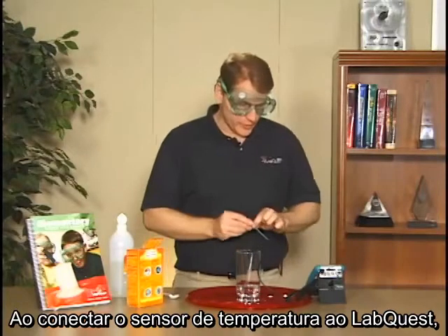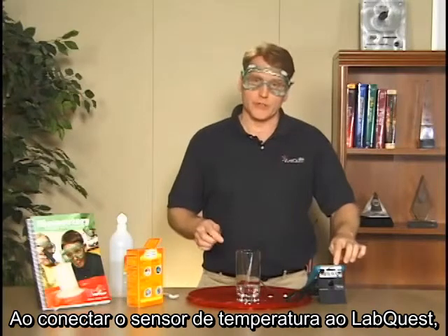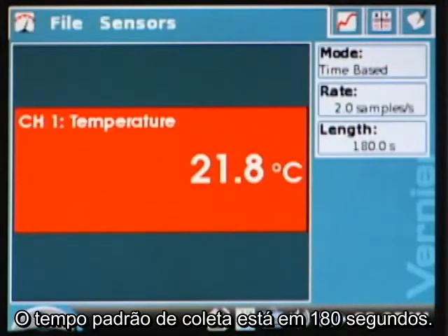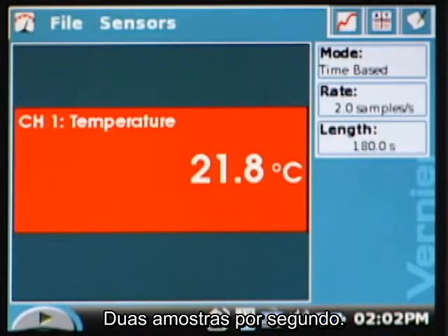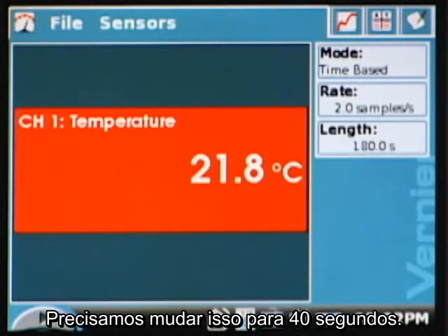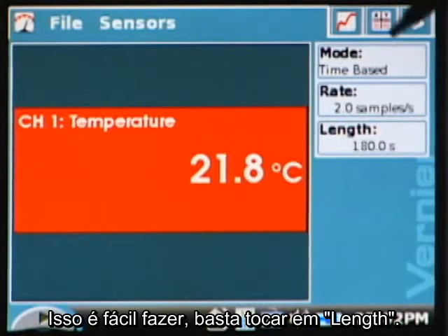When you plug in the temperature sensor to the Labquest, it auto-IDs the sensor. And right now it defaults to being 180 seconds for our time and 2 samples per second. But in the lab, it doesn't want us to use that long of time, and so we need to change that to 40 seconds.